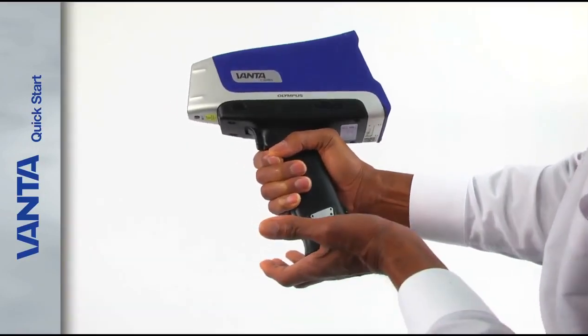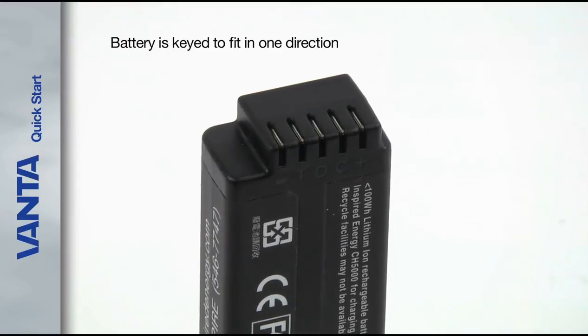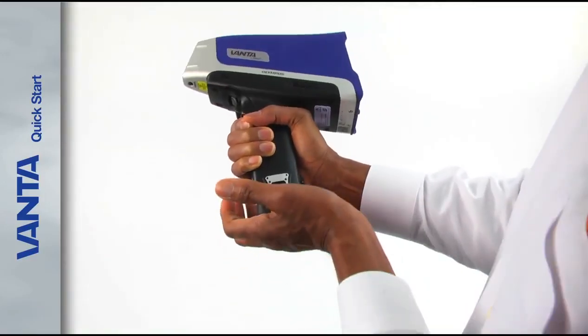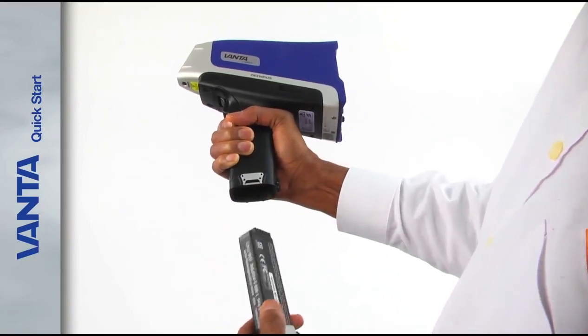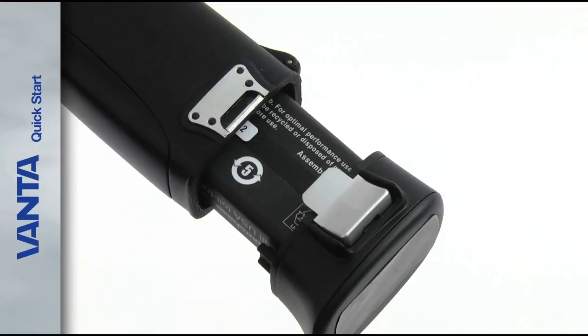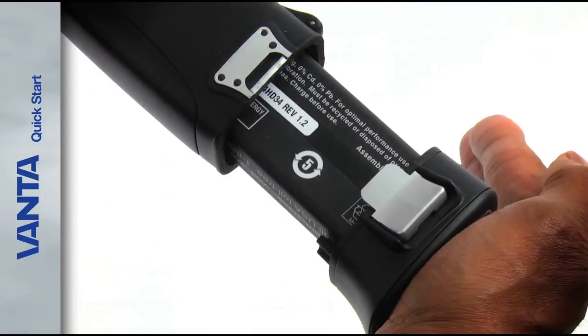To use the Analyzer, insert one of the fully charged batteries. The battery is keyed to fit in only one direction. If the battery won't easily go in, take it out, rotate it, and try it again. When the battery is inserted correctly, the hinge latches on both sides of the handle lock into place with an audible click.